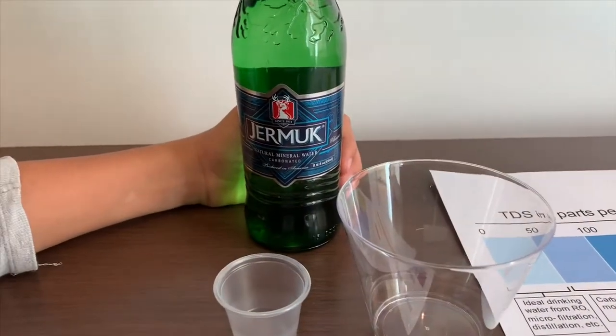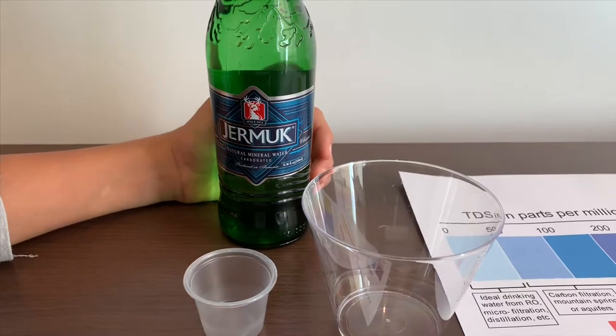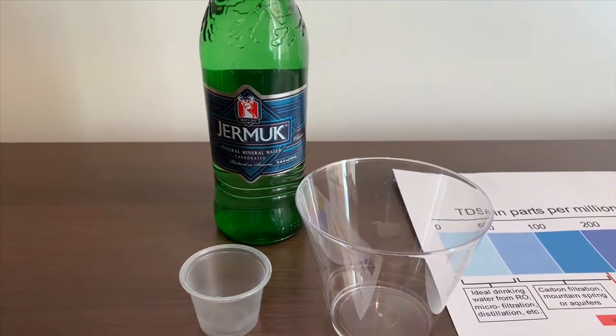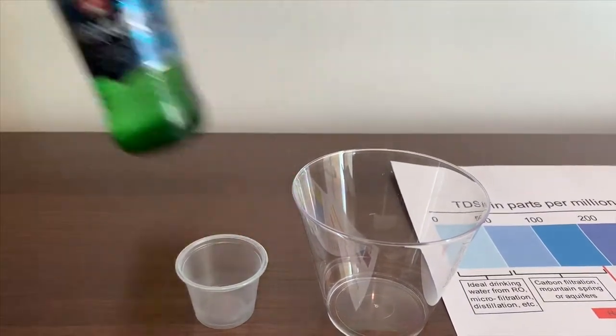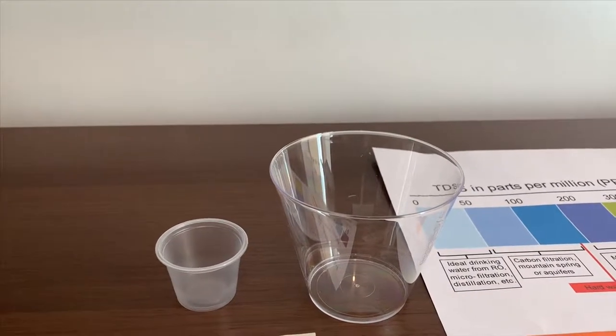This is James with Natural Mineral Water from Armenia — it is 79 cents. Today we're going to test the TDS level and pH level. First we're going to test the TDS, and then we're going to test the pH.